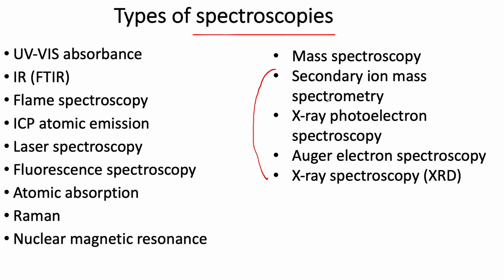So secondary ion mass spectrometry, what you do is you send an argon ion in, or an oxygen, something like that, so you know what you're sending in. That argon ion comes down to that surface, smashes into it, and provides enough energy that something else comes out. Well, whatever's on the surface comes out. So if you have silicon on the surface, you'll see silicon coming out. If there's silicon and oxygen, or maybe a little bit of a dopant there, some selenium or sulfur, you'll see those too. So you're looking for the different atoms usually that are coming out.